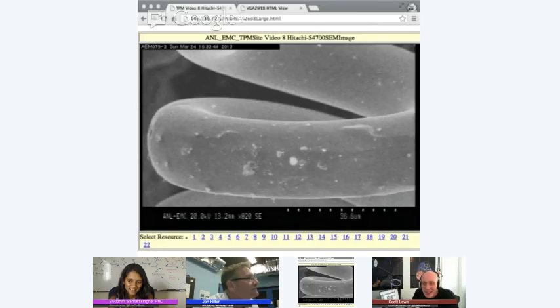And this is the tungsten there. So you can actually see, is that just some manufacturer defects on that, or is that just dust? When we're at this level of magnification, it's very difficult to get something that's got a pure surface to it. Right. This actually came from a light bulb in my house that operated very well until I broke it. Probably has some residue of something from inside the light bulb in it.